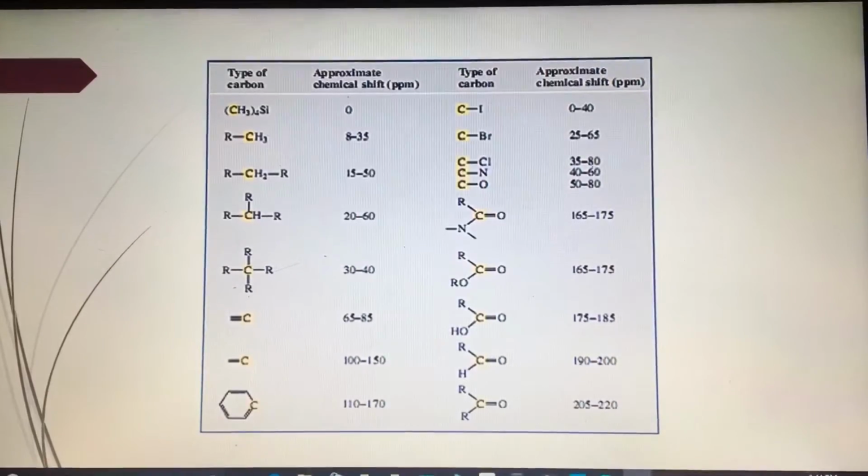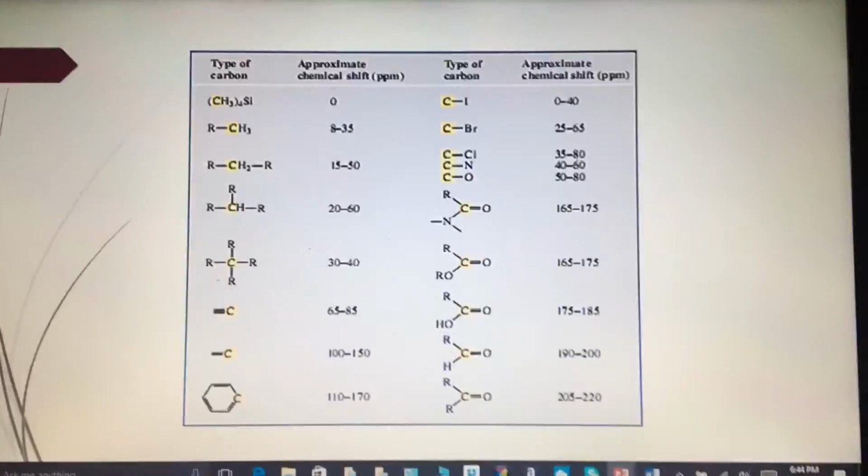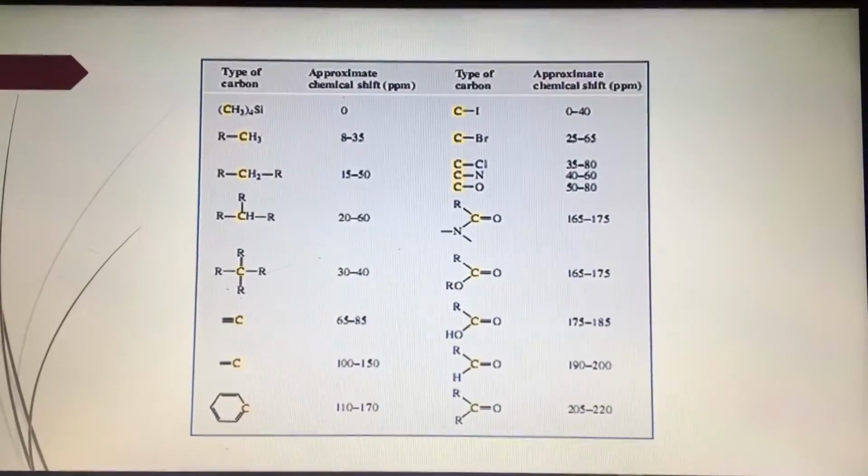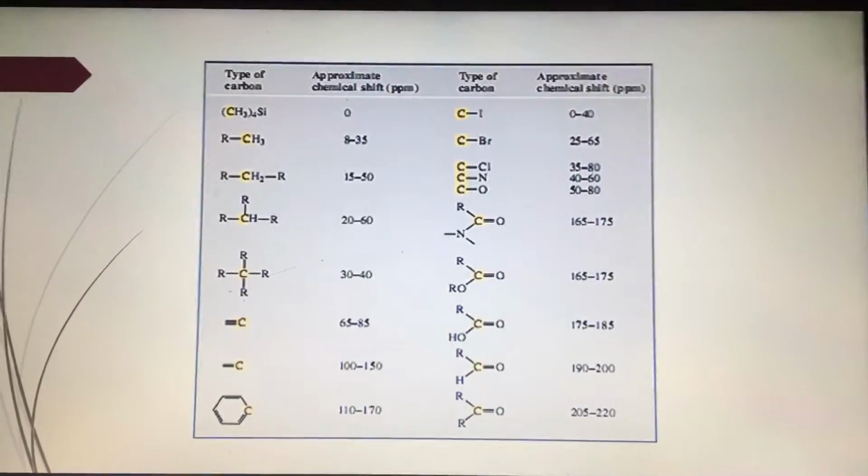Once an NMR spectrum is relayed to the computer, a graph is produced that shows the peak points of certain bonds that are affected. These values show the chemical shift taking place during the test to identify the bonds present.